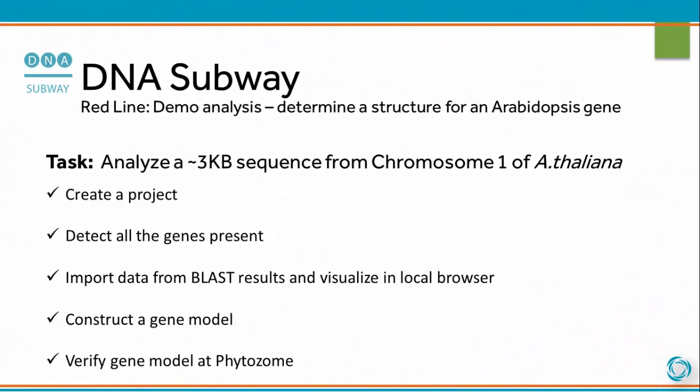In this demo analysis, we'll determine the structure for an Arabidopsis gene. We'll analyze a 3 kilobase sequence from chromosome 1 of A. thaliana. We'll create a project, detect all the genes present in the sequence, import data from BLAST results and visualize in the local browser, construct a gene model, and then verify the gene model in Phytosome.